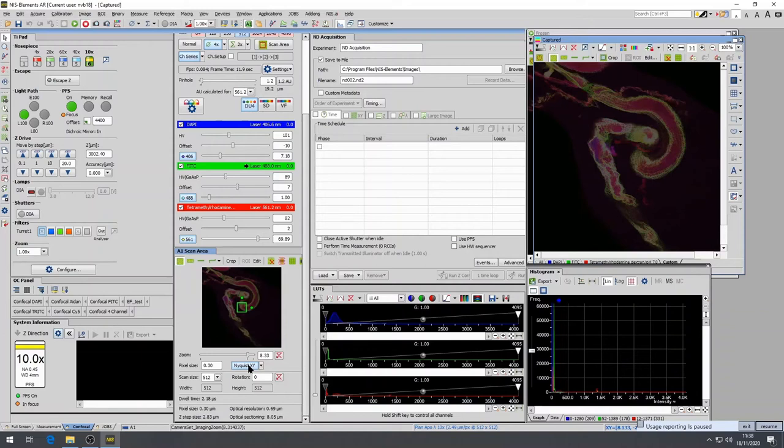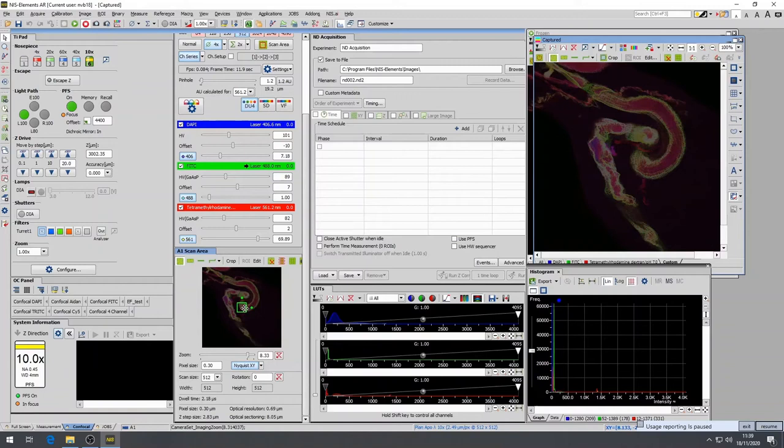Once the Nyquist XY button is selected, the scan area will decrease substantially as the pixel size is reduced. Alternatively, the scan area can be manually changed by modifying the zoom factor or by dragging the corner of the scan area. The pixel size will adjust automatically to the size of the modified scan area.